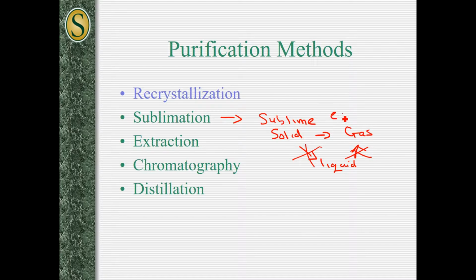An example for this is dry ice. If dry ice is mixed with, say, carbon, which does not sublime, you would just let the dry ice sublime off and collect it on a cooler surface, like a watch glass which has cold water. The block of dry ice sublimes onto the cooler surface, and you would collect it by scraping it off.